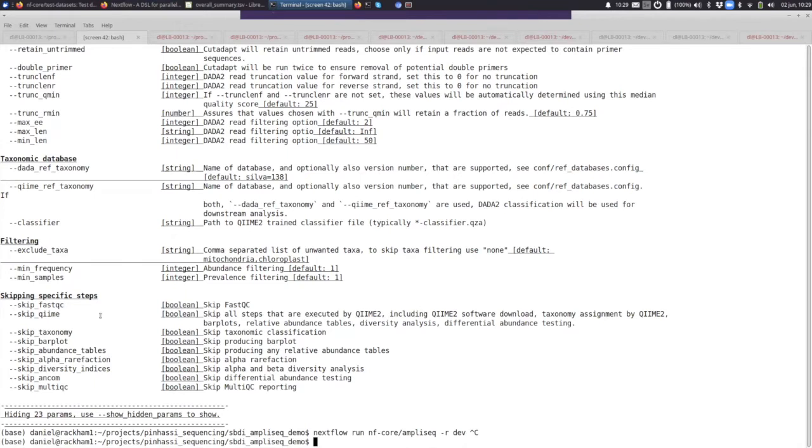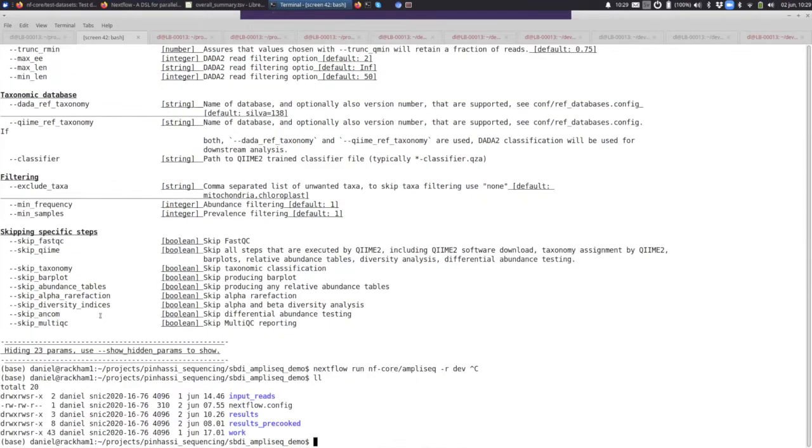It is recorded, by the way, but you can redo it easier with your configuration file. And the configuration file then is called nextflow.config by default. You can actually have a set of those. So if you're interested, look up the Nextflow documentation for that. But here I'm just going to use this default.